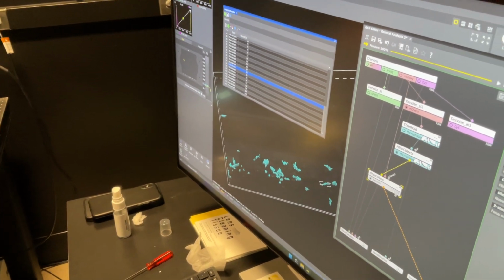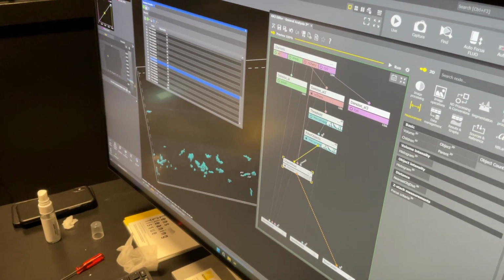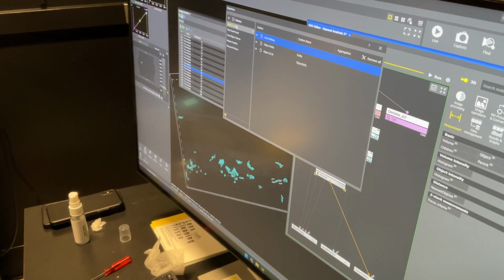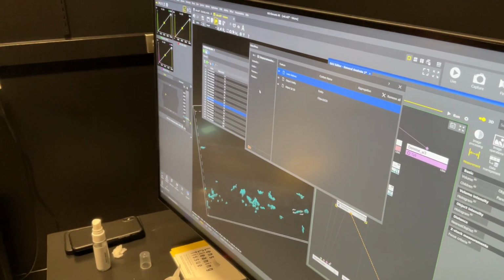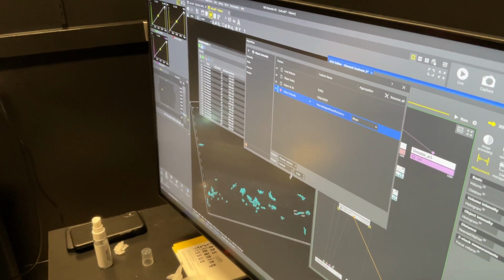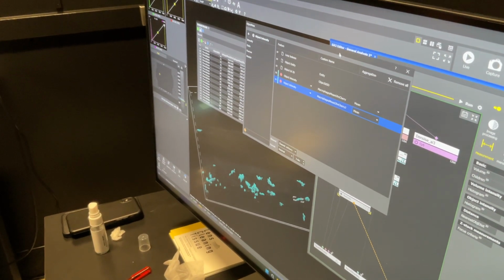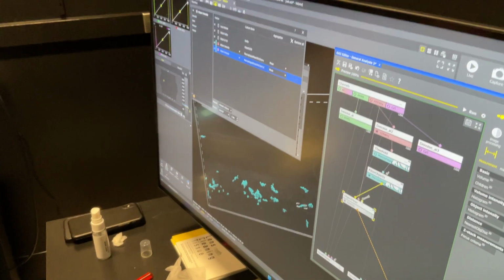So now you kind of notice a theme here: anything that you can interact with that has settings has the little dot dot dot, and we can come in and say, okay, I want to get the total measured. Well, we probably don't want the whole thing. Volume intensity or object intensity. In this case, each one of these is an object. So then I can come in here and say, give me the intensity of the mCherry channel. Great. Give me the intensity of... and in this case, every time you link it to a channel, you get an extra channel node.